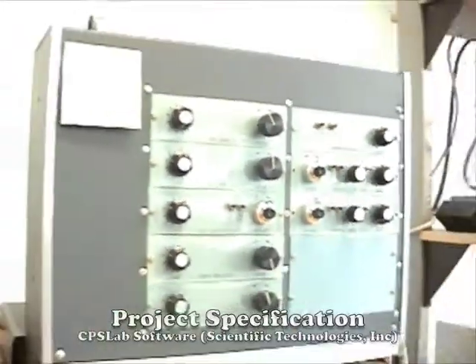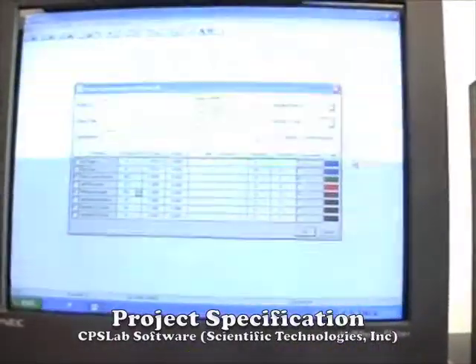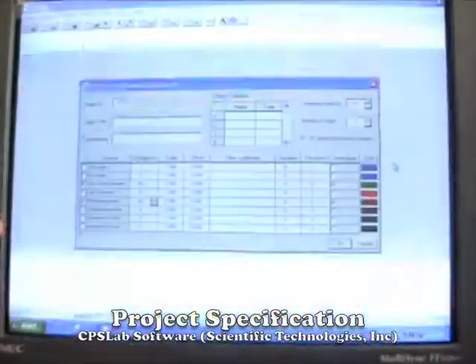So the software interfaces with this program. And the point of the software is for it to be as smart as possible, so the user doesn't have to do a whole lot of adjusting on the machine over there. So we again have a logical procession of things where we have to set up a project, and then we create event lists and stimuli, and then we can actually run a subject through the protocol and then analyze the data. And so again, everything is stored in one folder. So it's the folder wherever you specify your project, so everything goes into that folder.